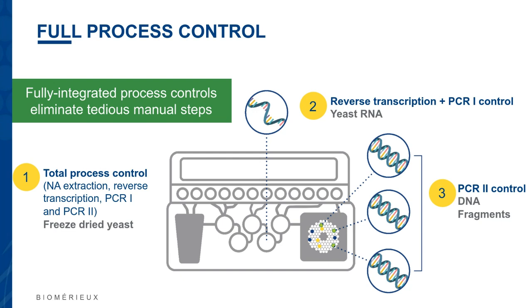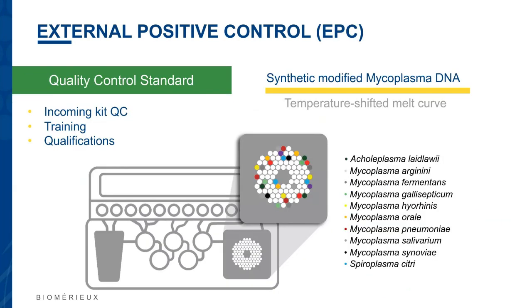And also we developed what we call external positive controls that allow the quality control of the incoming kit, the incoming QC, or they can be used for the training of the operators, but also for the qualifications.